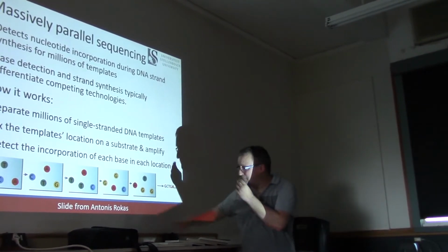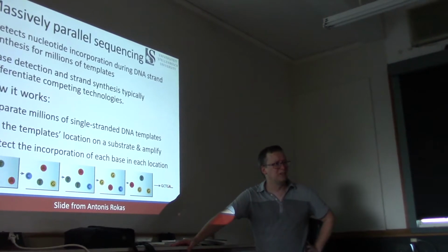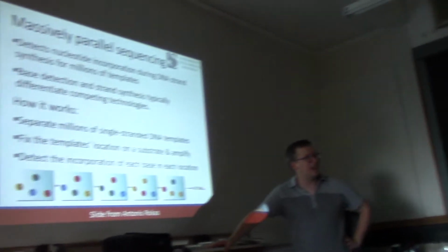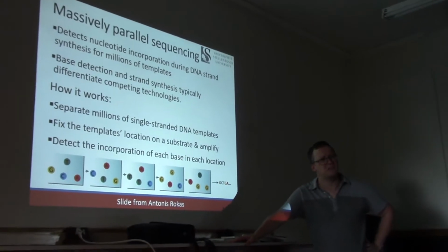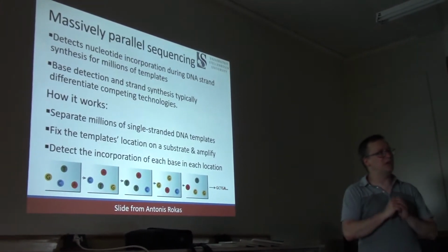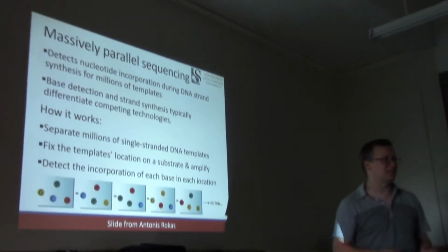Now, a lot of times, you'll find this called next-gen sequencing. But I would also point out that we've been calling it next-generation sequencing since I was a postdoc. And that's a very long time. At what point does next-gen get supplanted by the next-gen? It's kind of a bad name, right? So I'm going to refer to this as massively parallel sequencing instead.